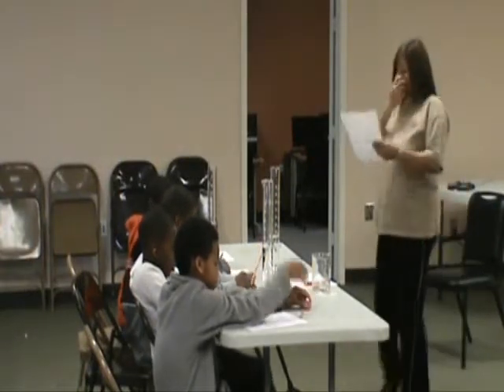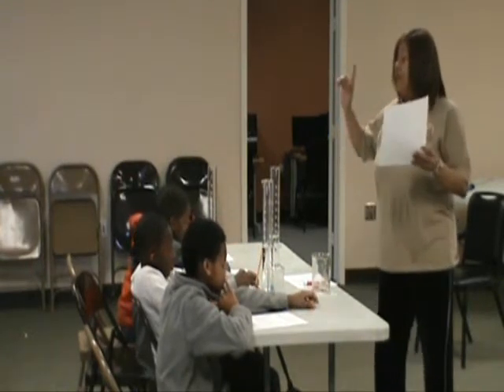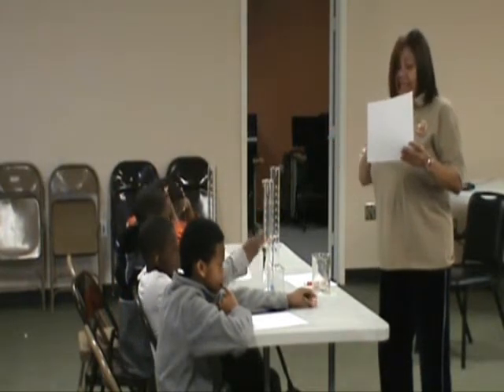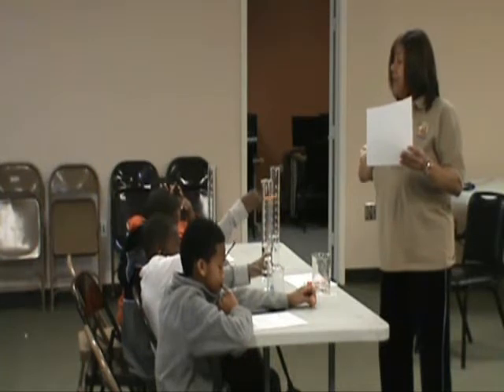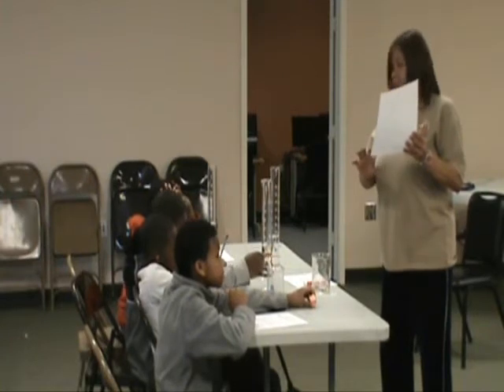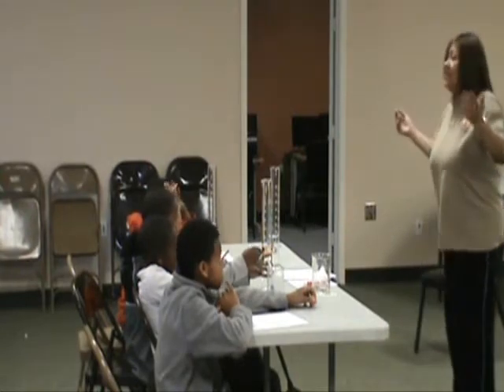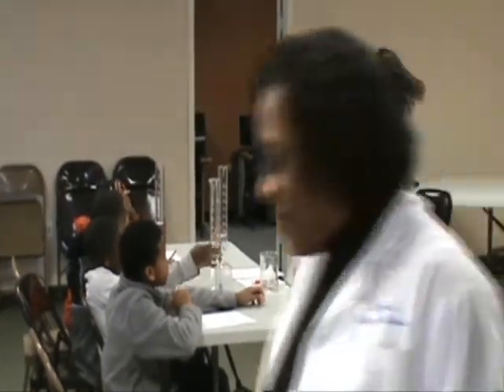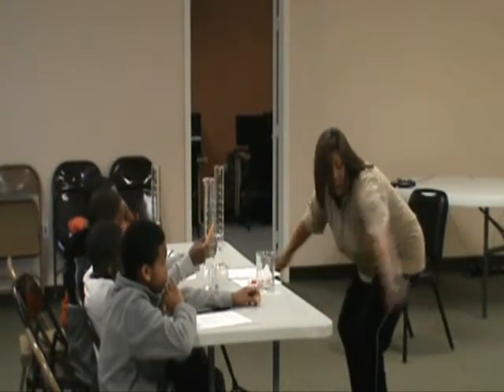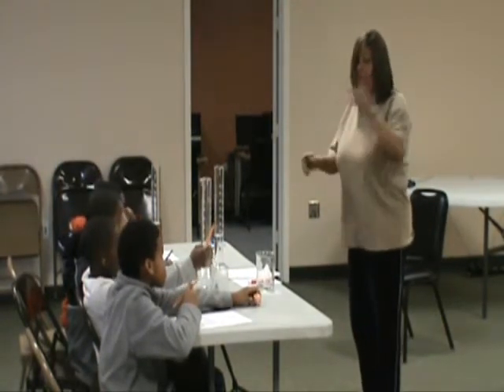Before we go to that balance, let's go down to number 5 and put that data in right now. I'm going to read very slowly here because I want everybody to know exactly why we're doing this. It says, using the data table below, this is where your volume information goes. Determine the displacement volume. Watch me up here. If I jump down in the pool, my mass will take up space and push the water around. All the water that goes around me will rise around me. In other words, I'll take up the space where the water was.